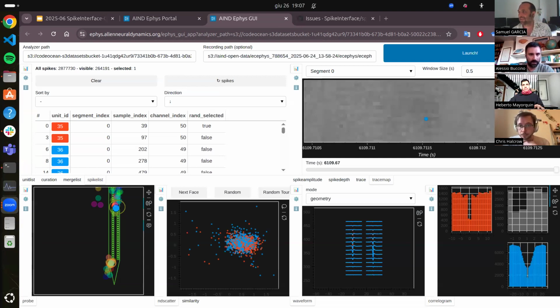So this was from Tommy, and it's one question about a bug in the remove artifact. Yeah, can you please ping us, send us a reminder. Sorry about that. We try to fight bugs directly in SpikeInterface. Alberto, Chris, and others, we try, but it's hard to manage everything at the same time, so there's room to improve.